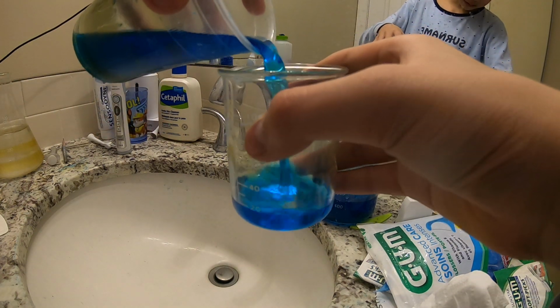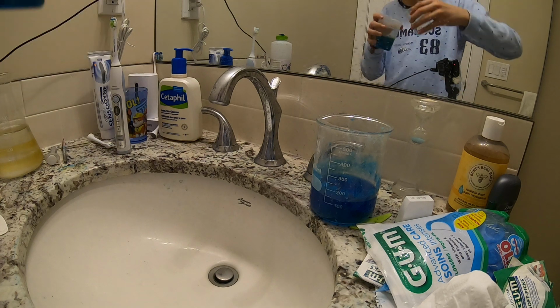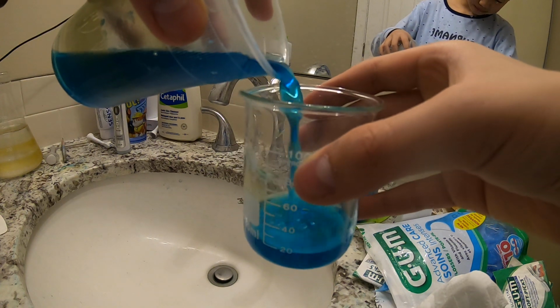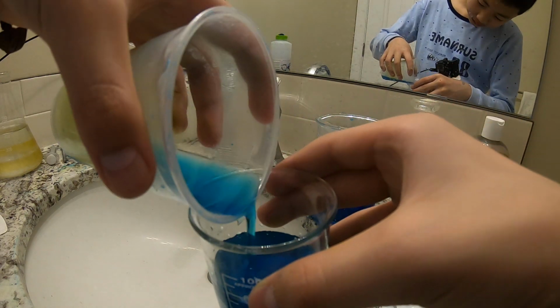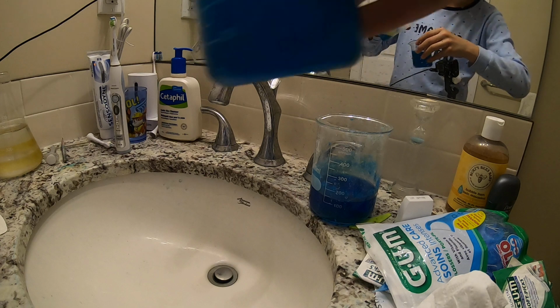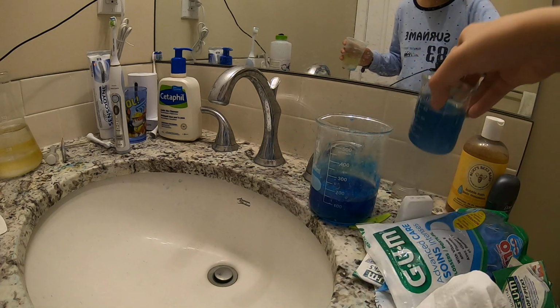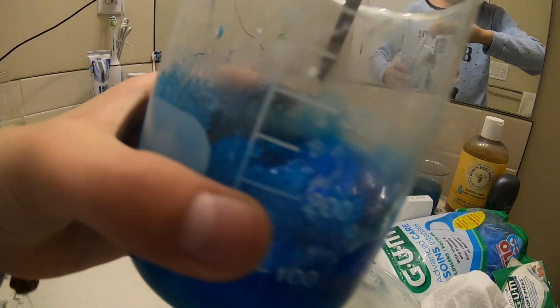Put this in the beaker. Dang it, that's sad. So, all right, so trying to be careful not to get this dirty stuff in. Interesting. Doesn't seem to be a lot of it, is there? Wash the little crystals in. Set that aside. Push this in. Dang it.